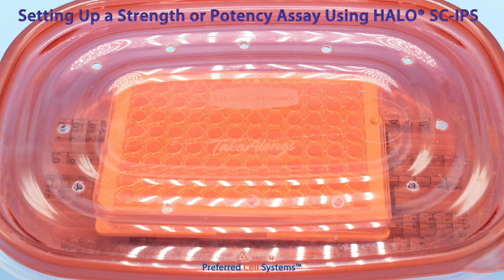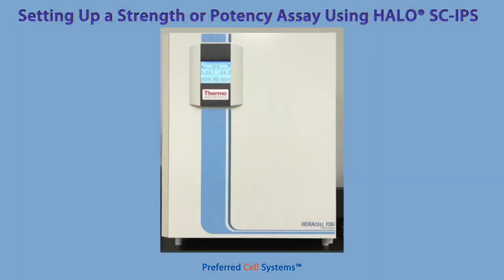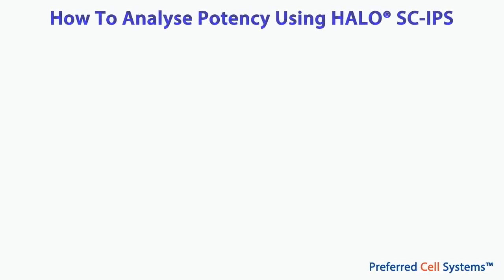Incubation can, if necessary, be stopped at 5 days. However, between days 5 and day 7, there is a 2 to 3-fold exponential increase in stem cell proliferation. This results in a 2 to 3-fold increase in sensitivity of the assay. Now let's take a look at the results you might get.